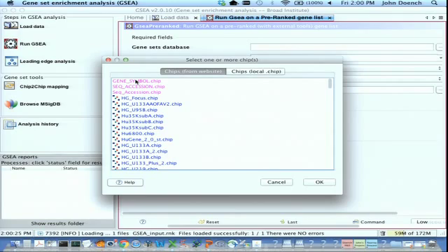You want it to be gene symbol because that is what you used. That is what is designating the gene. That's how it knows, okay, this is what the gene is. In theory, you could use seq accession, but again, everything we've been doing has been in gene symbols. So you select gene symbol.chip.